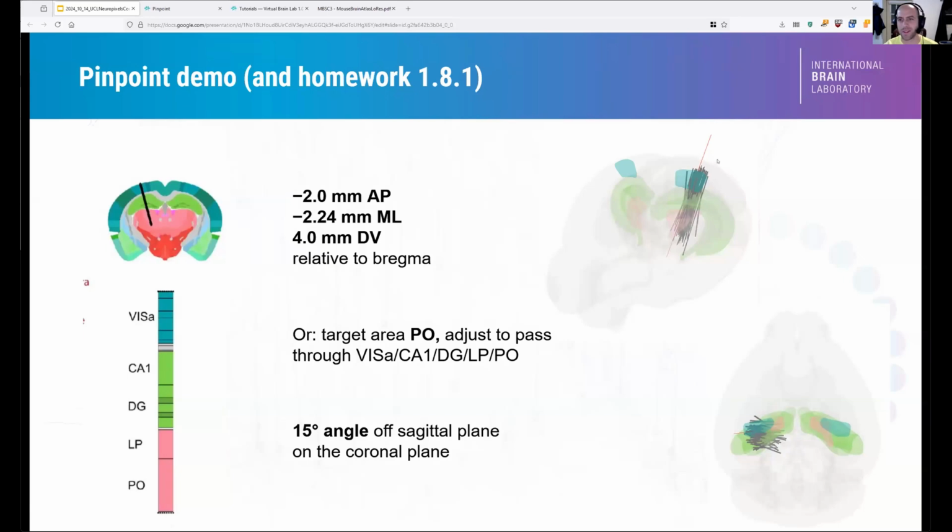Oh, and I wanted to mention in the real experiment that was done where a whole bunch of postdocs redid this over and over, they all missed by small amounts. So don't worry if you plan this trajectory and you miss by a small amount, you're in good company.